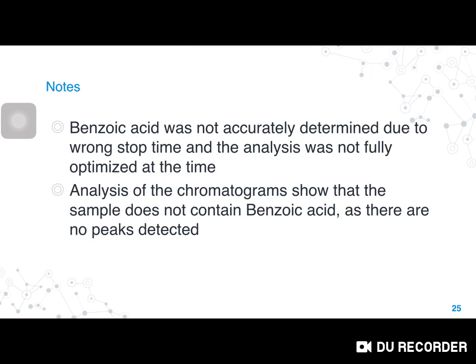Benzoic acid was not accurately determined due to a wrong stop time, and the analysis was not fully optimized at that time. Analysis of the chromatograms shows that the sample does not contain benzoic acid as there are no peaks detected.